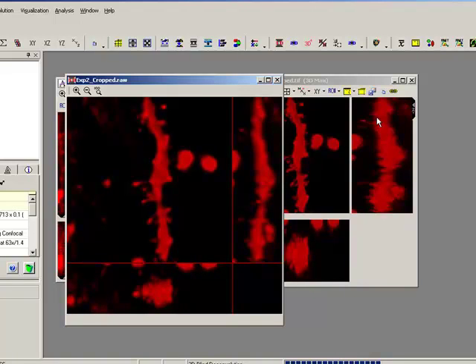So let's just wait and see. You can actually also save the point spread functions, and you can compare those as well. You'll see a different point spread function when you use a spherical aberration detection, which I haven't done in this case.